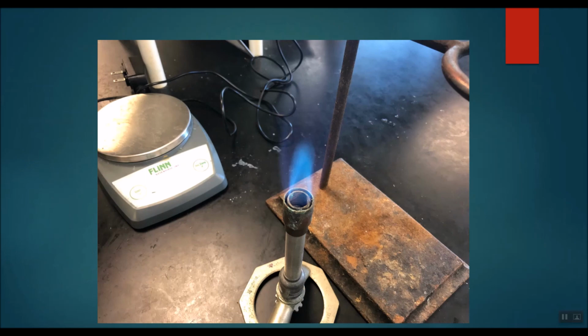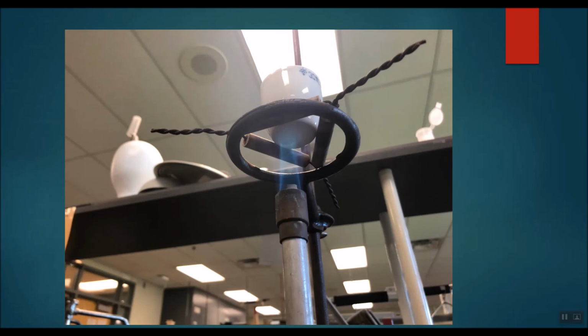We need to get this Bunsen burner going, and it needs to be super hot. So notice the flame within the flame. We need this very tip to be hitting the bottom of that crucible, because that crucible is going to need to get very, very hot. So here it is. You can see the tip is hitting the bottom of the crucible. So we're ready to roll. This is what you can see.